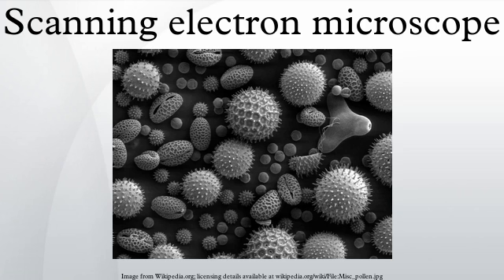Other types of electron emitters include lanthanum hexaboride (LaB6) cathodes, which can be used in a standard tungsten filament SEM if the vacuum system is upgraded, and FEG, which may be of the cold cathode type using tungsten single crystal emitters, or the thermally assisted Schottky type, using emitters of zirconium oxide.